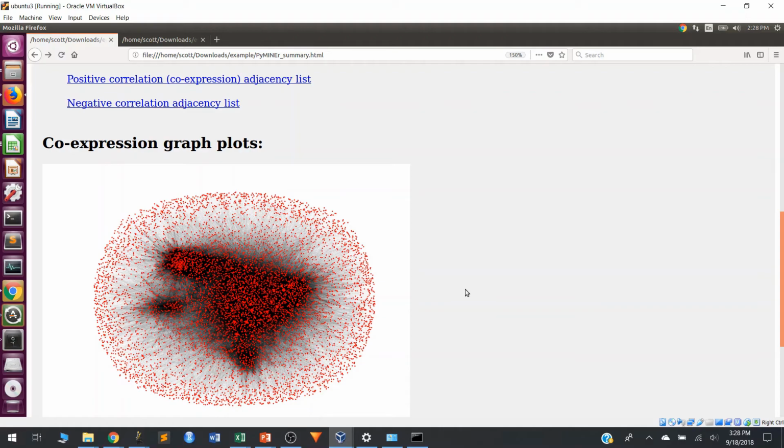So they are expressed together in a concomitant way, where if you have high levels of gene A, you also have high levels of gene B. What that will look like here is this would be gene A, and over here would be gene B. So all of the genes that are localized in this general area are highly co-regulated.